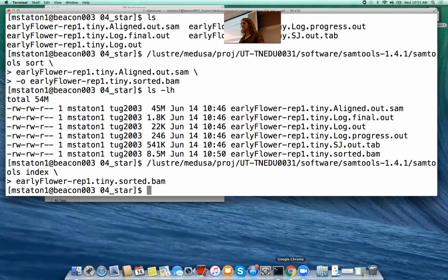Okay, here's another interesting one I'm just going to point out real quick. In this one you can see that the bar is half red and half blue. The reference is a T, and it's split between C's and T's. It didn't put a T here because it's the same as the reference. So for every read where you don't see a C, it's actually a T, so it matches the reference. So that would be a heterozygous SNP. We did manage to get both alleles in this gene. Okay.